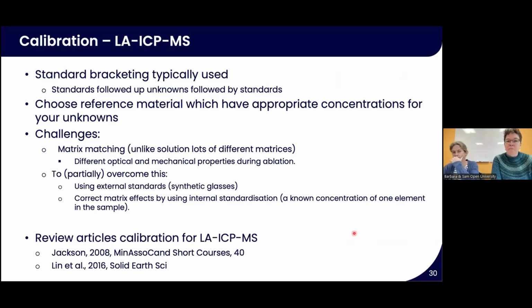It is also important to choose reference materials of appropriate concentrations for your unknowns. However, this is quite challenging because we can't just dilute our samples or our unknowns appropriately, because it's all a solid. So sometimes we have to make a few more compromises here than on the solution side of things.